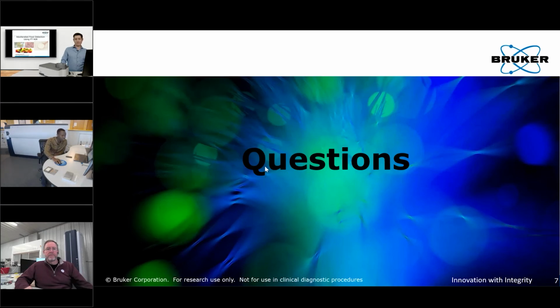We actually have another one for you. I think this will be a quick one. How do your certificates of analysis look? Great question. We really have a hybrid. There are many times we'll be submitted a sample that may be novel, that may not have a lot of published literature to reference.